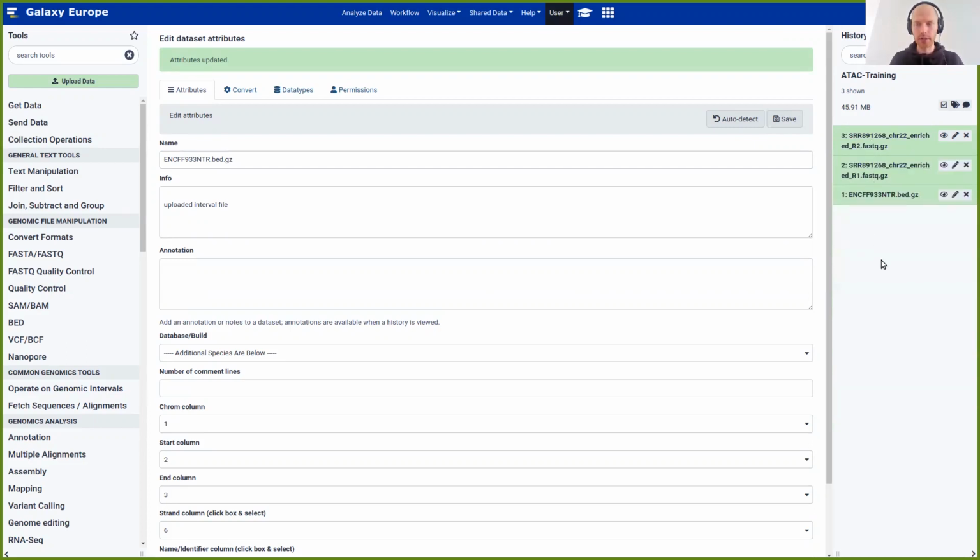So as you already can see, this ATAC-Seq data is in paired end, or was done in a paired end sequencing. So we have the first mate here and here the second mate. That's why you have R1 and R2. So this is one sample.